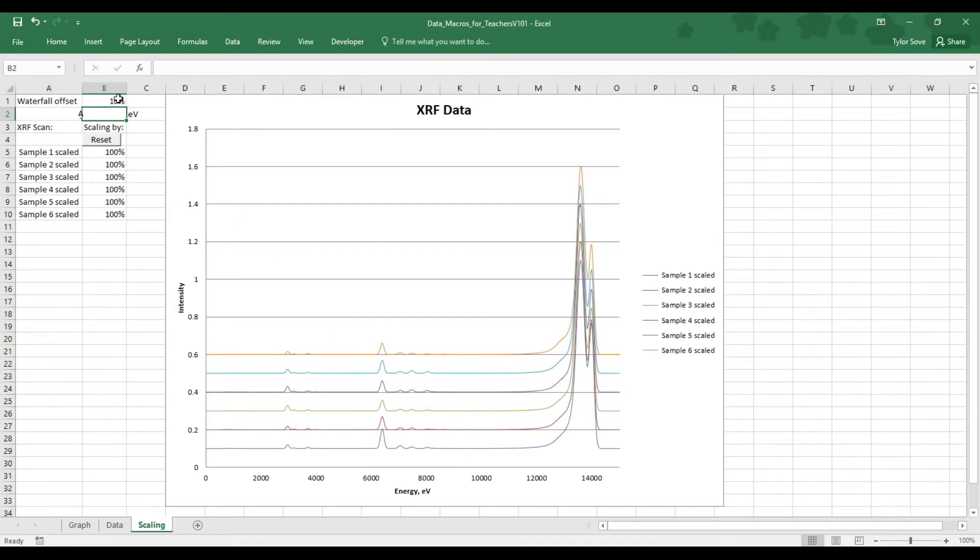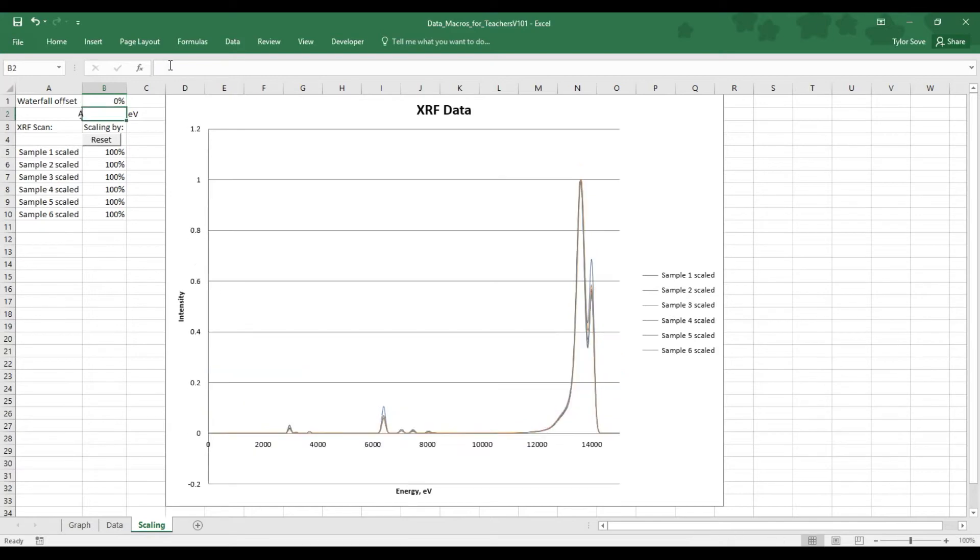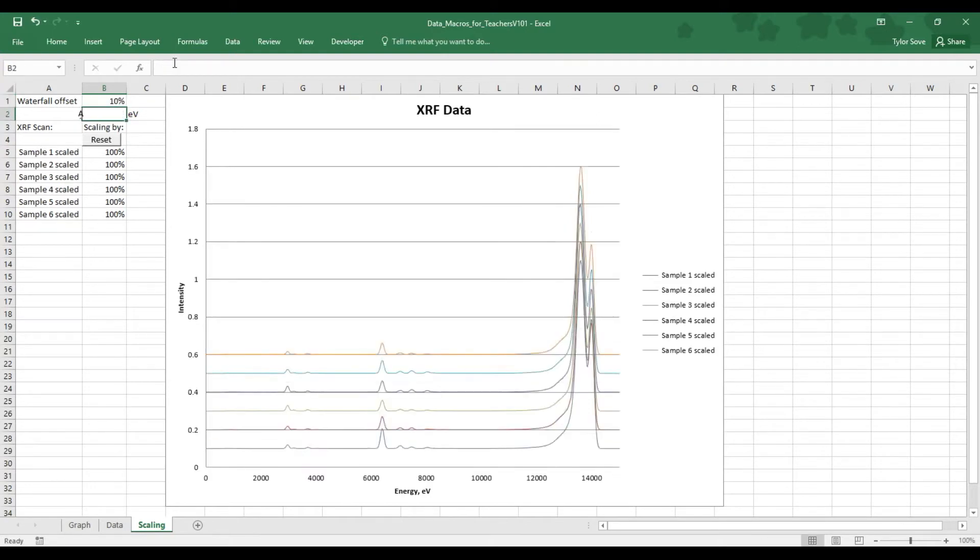If we instead want to see them stacked on top of each other, go ahead and select 0 for your offset value, and you can see it's all on top of each other right here. Let's put that back to an offset value.